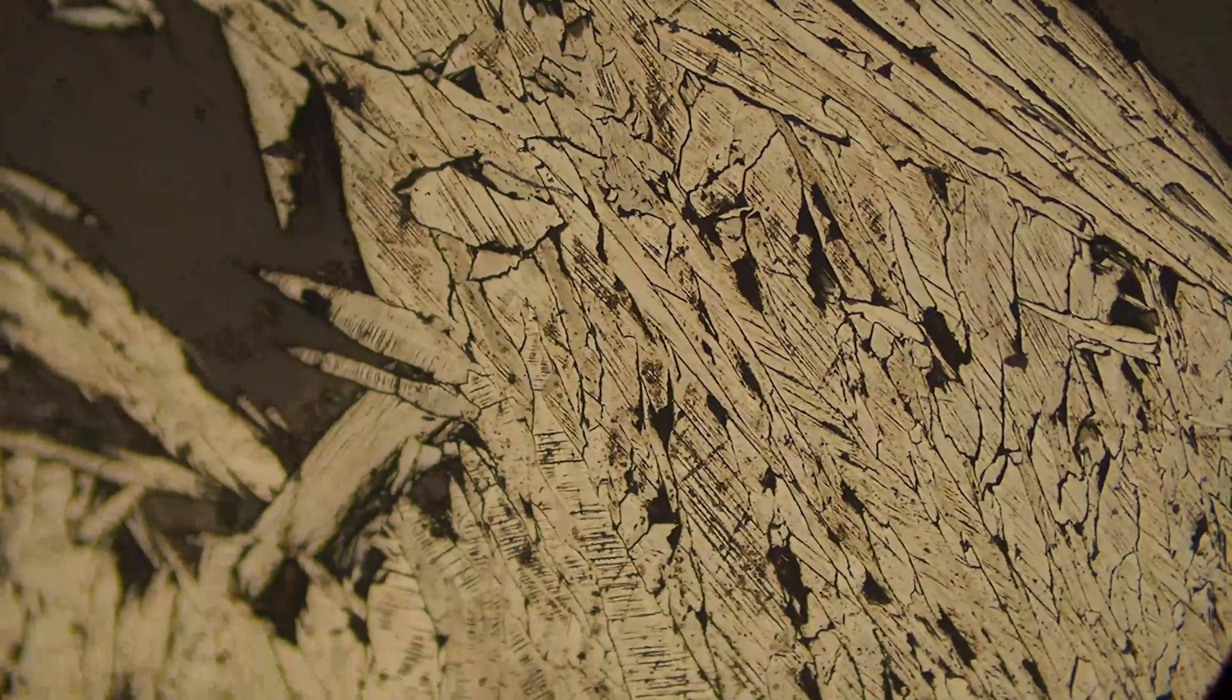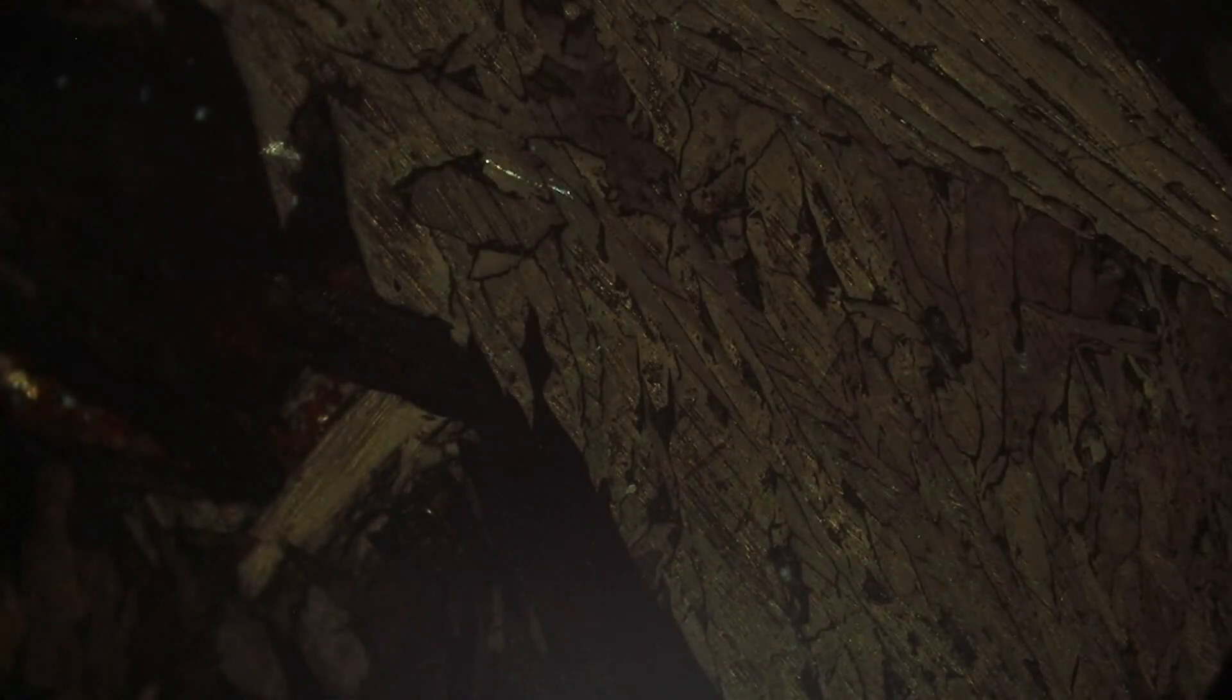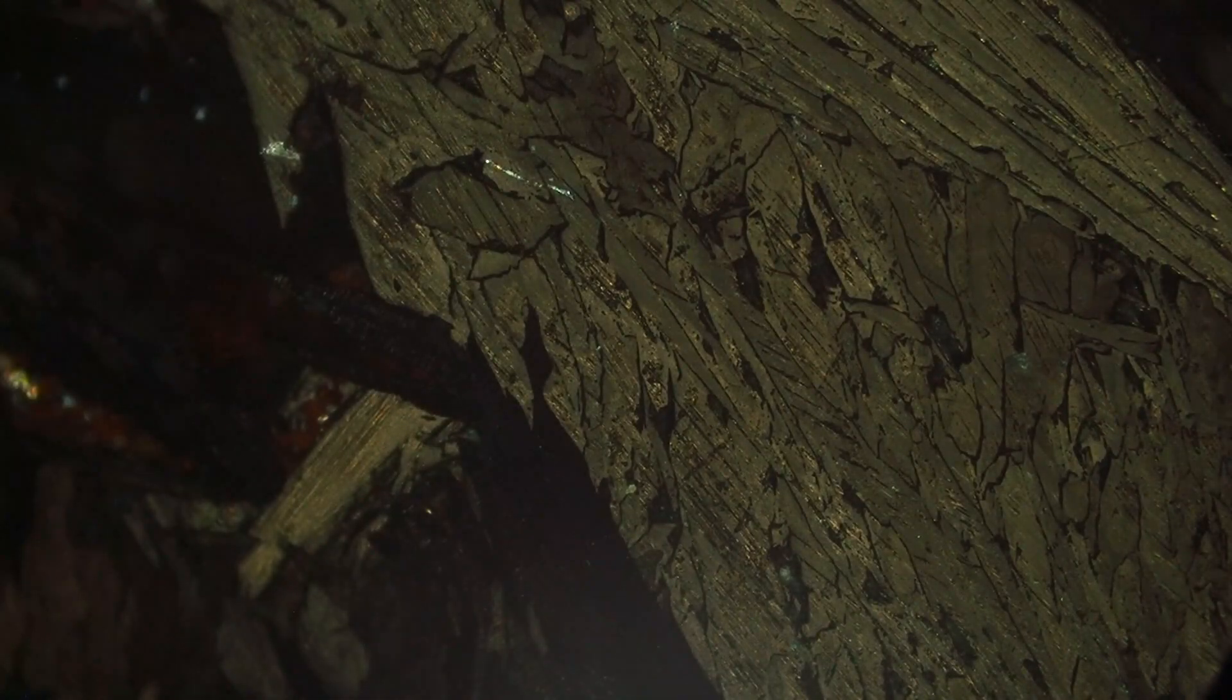If we cross the polars again, as we rotate the stage, it goes from gray-blue to more of a gray-yellow color. Here and there you're going to see some red points as well, which is due to the internal reflections of hematite.